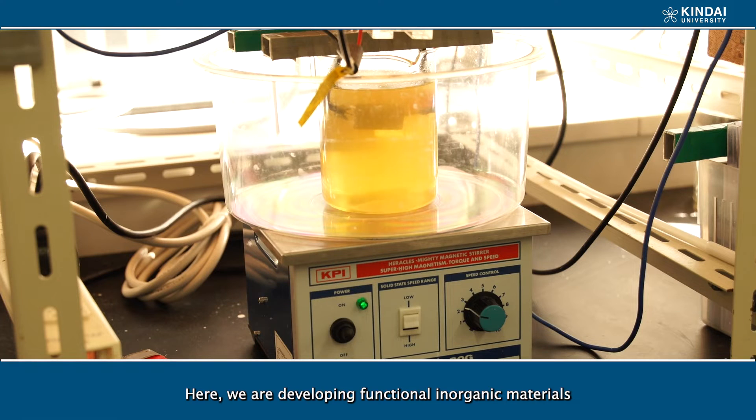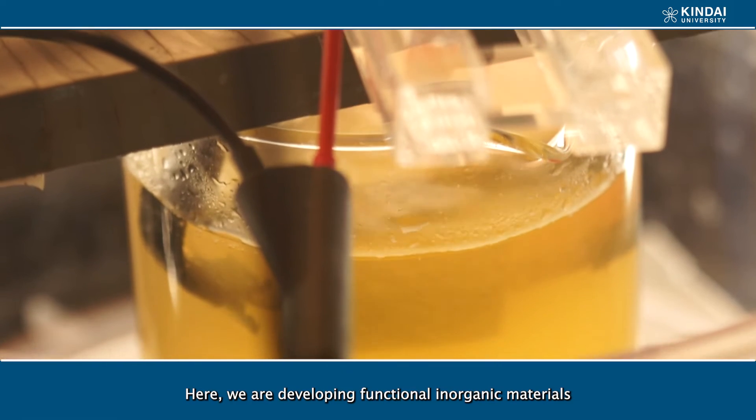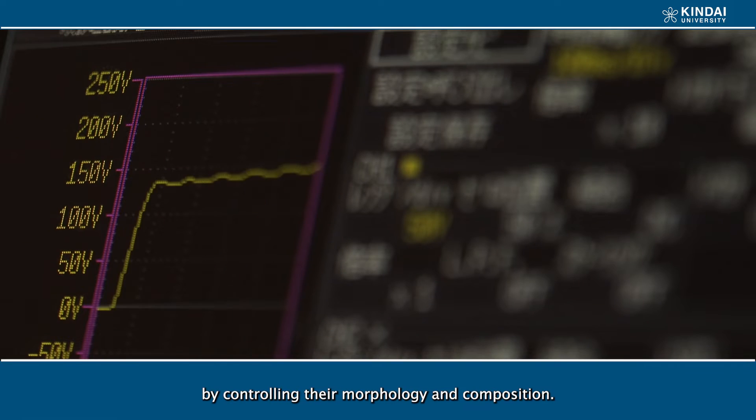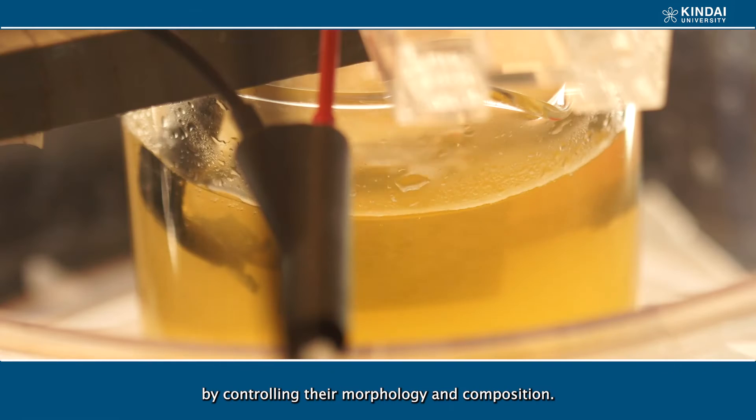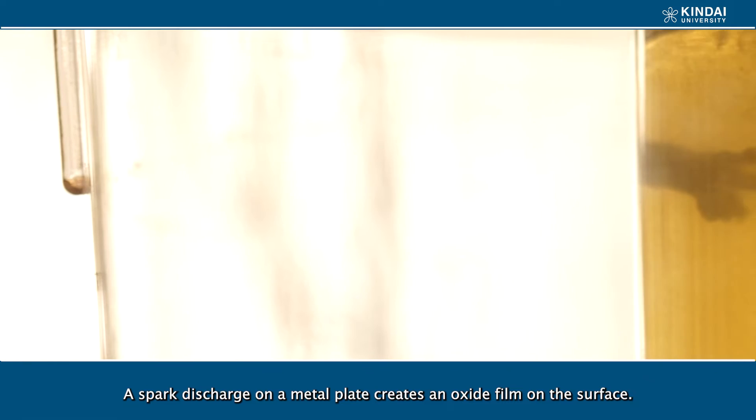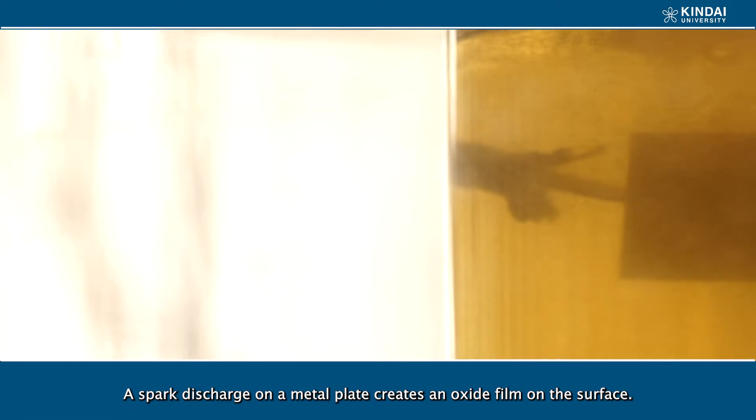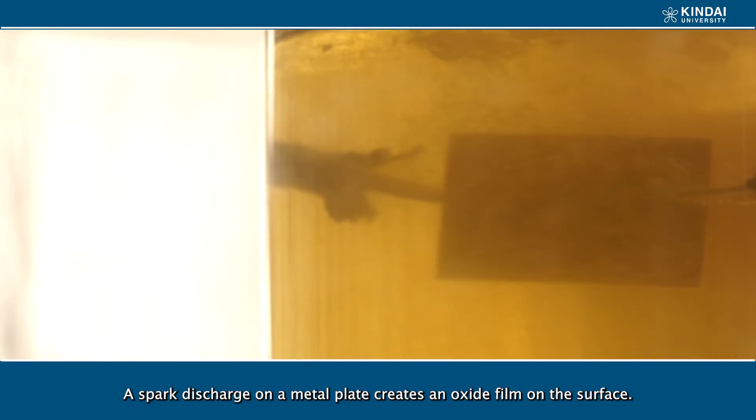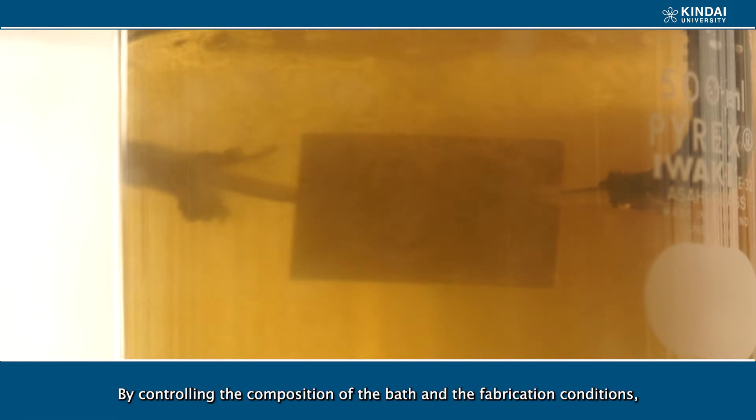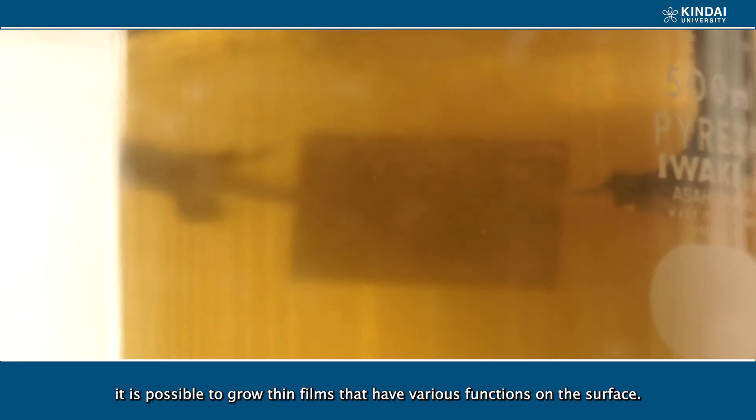Here we are developing functional inorganic materials by controlling their morphology and composition. A spark discharge on a metal plate creates an oxide film on the surface. By controlling the composition of the baths and the fabrication conditions, it is possible to grow thin films that have various functions on the surface.